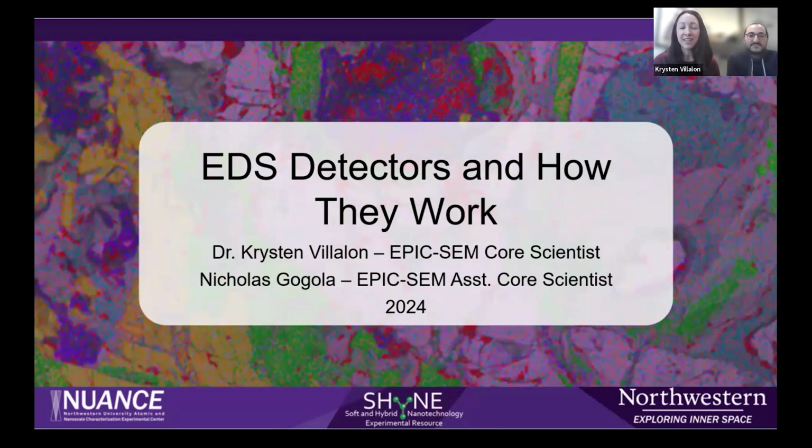So our tech talk today is going to be about EDS detectors and how they work. We know that a lot of users here at Nuance use EDS, might even use it regularly and are maybe familiar already with how to analyze EDS data. But you might not know anything about actually how the detector works. How do we go from analyzing the X-rays from our sample to actually getting a spectrum on the computer? So hopefully you'll get a little bit more insight into the technique after the tech talk today.